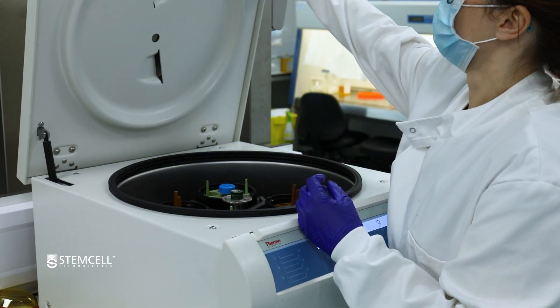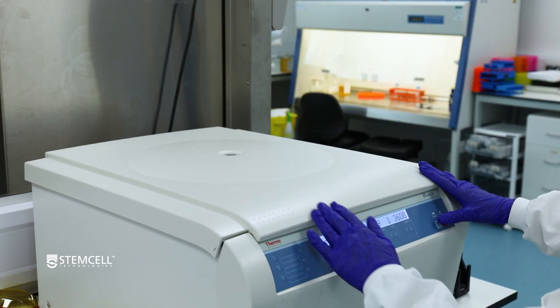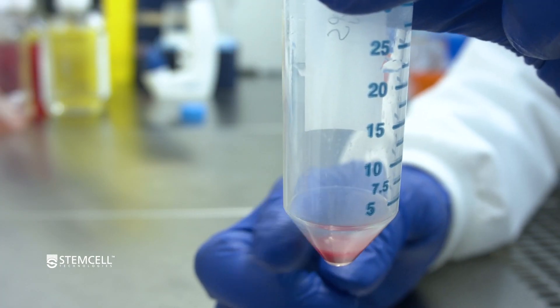Centrifuge at 300 times G for 10 minutes at room temperature with the brake on low. Carefully remove and discard the supernatant. Gently tap the tube to dissociate the cell pellet.